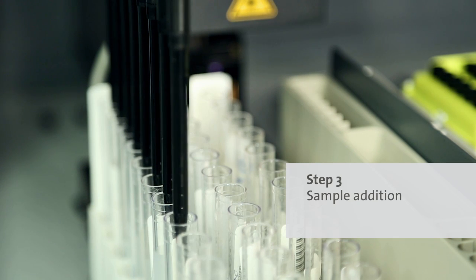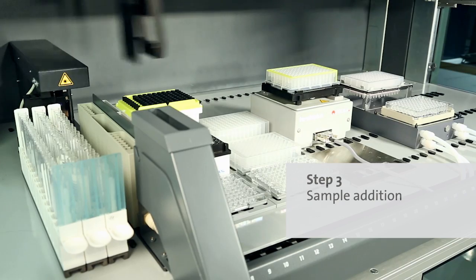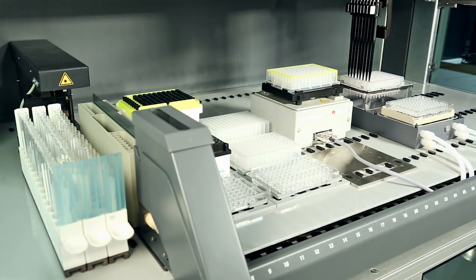Pressure-based and capacitive liquid level detection ensure that the transfers always happen as intended, first time, every time.